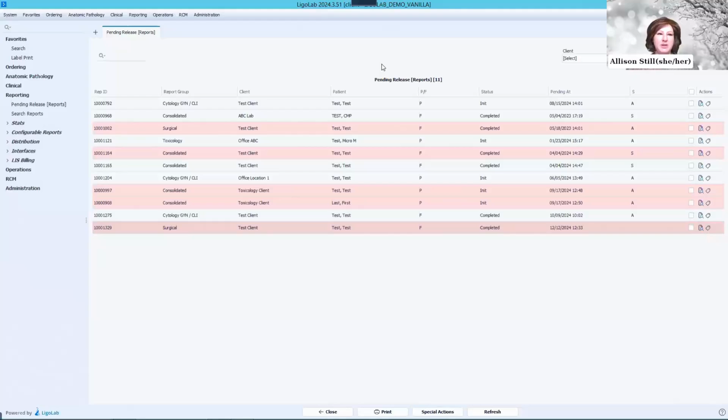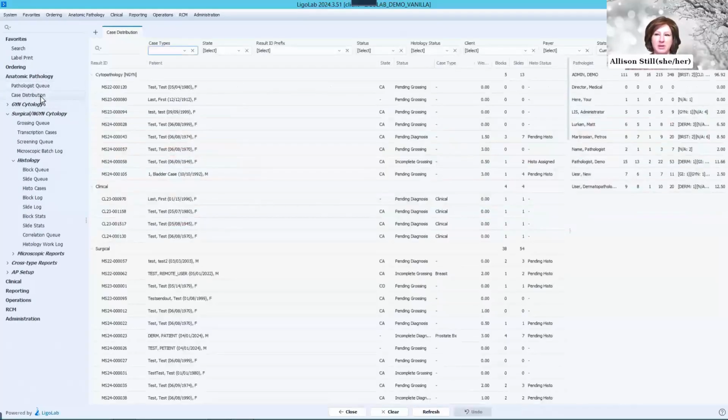Yeah, I would say it has two functions. One, like what you said, to balance workload using the weight properties, right? And the other one, it can be very important to make sure pathologists read cases that they're licensed to read, mainly with state licensure, right? Especially if you are a larger client, you're more likely to be taking cases from out of state. Not all your pathologists might be certified in those more niche states that most of your workload's not from.